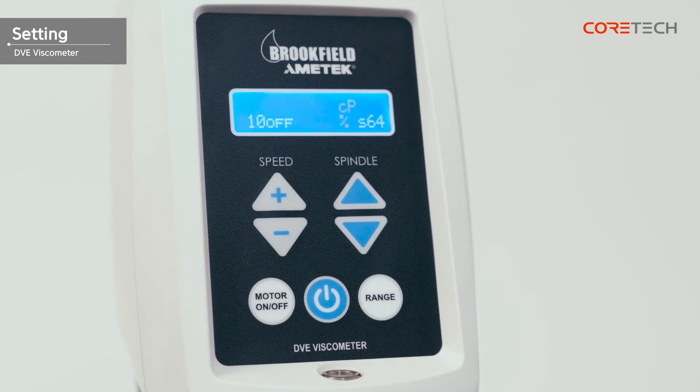If you do not know the expected viscosity value, first set the measurement range wider to see the approximate viscosity value. After that, you can narrow the range to measure more precisely.